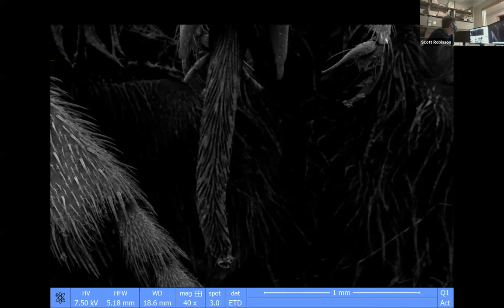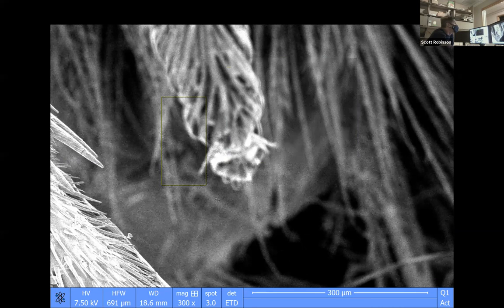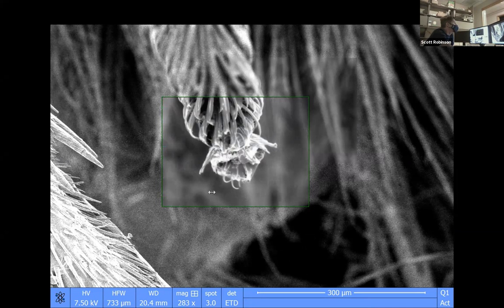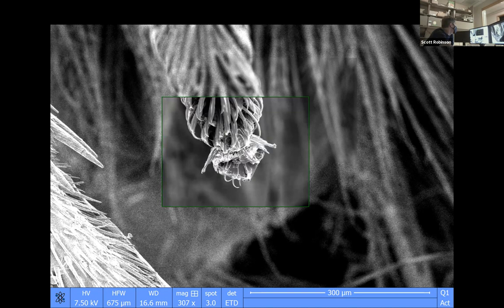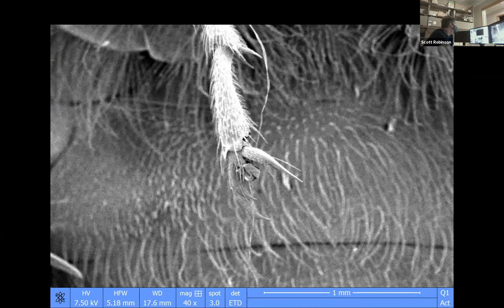We can bring the mag up a little bit, and we can see what the bee's tongue looks like up close. We put a small screen on here so that we can work on the focus in just one place. Now you can see what the tip of the tongue of a very small bee looks like. And then you can see its little hands. So it has claws.